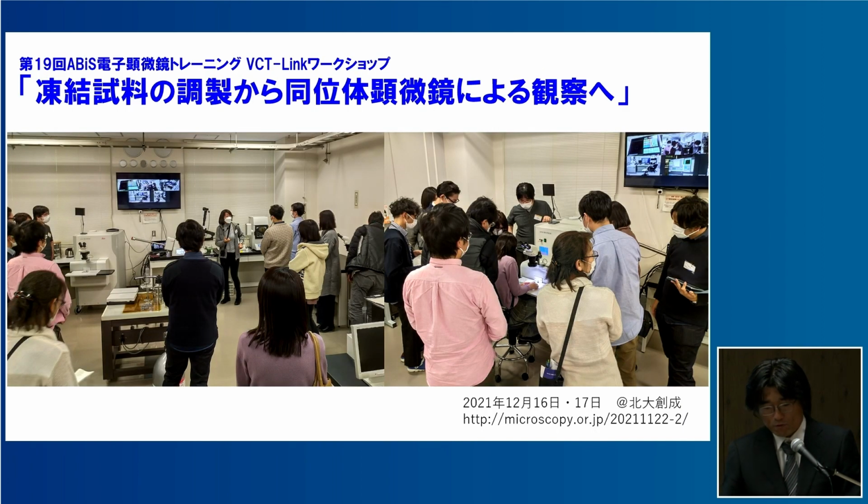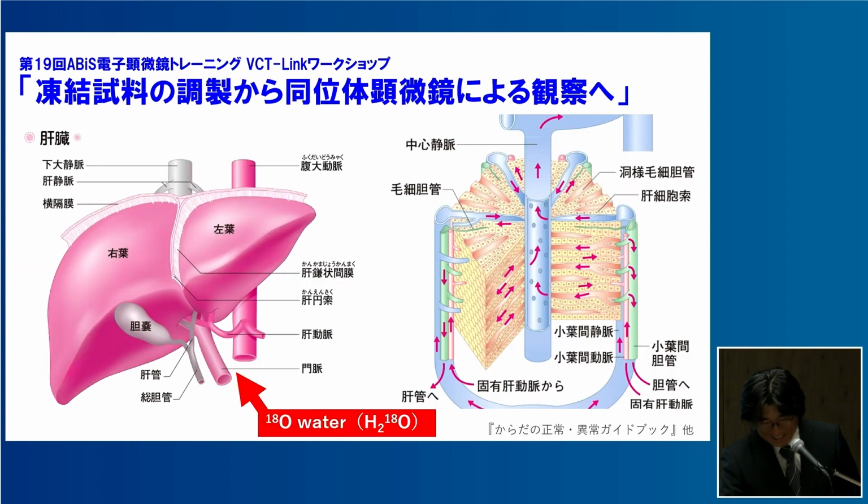A few years ago, we held a workshop on preparing frozen samples for observation with isotope microscopy. Many people attended. Kameda sensei was there and provided an example.